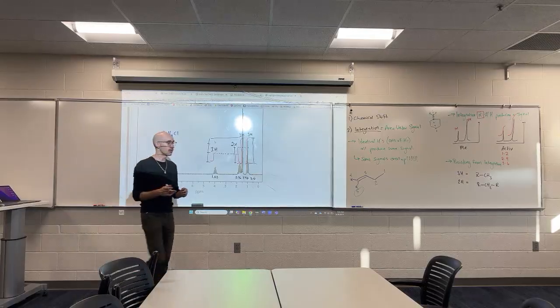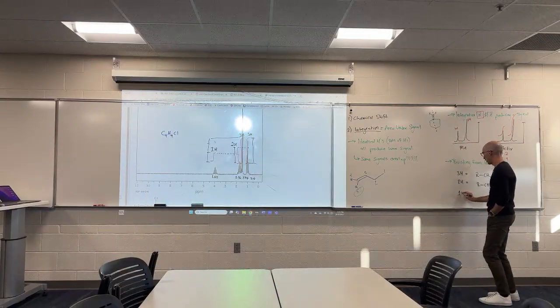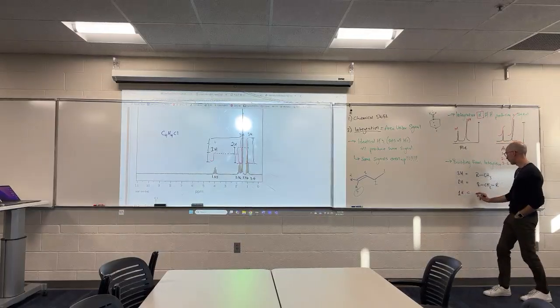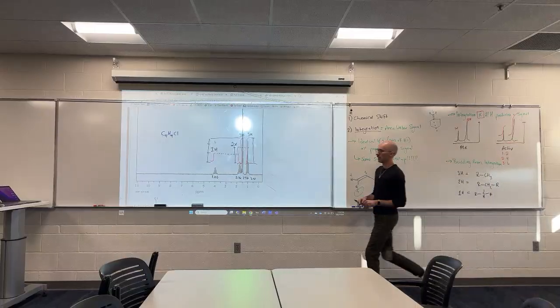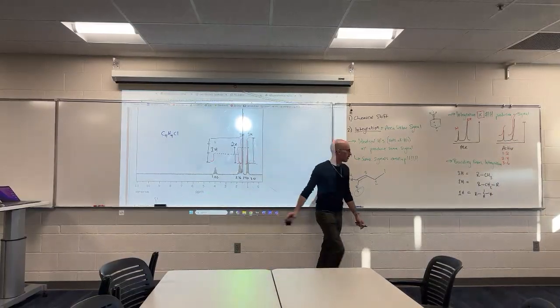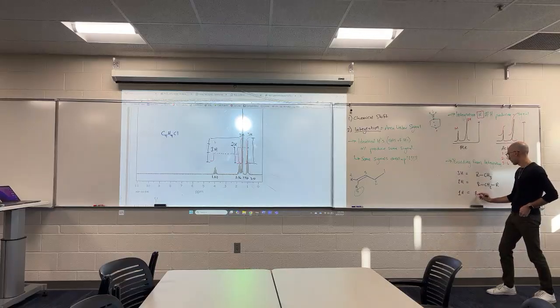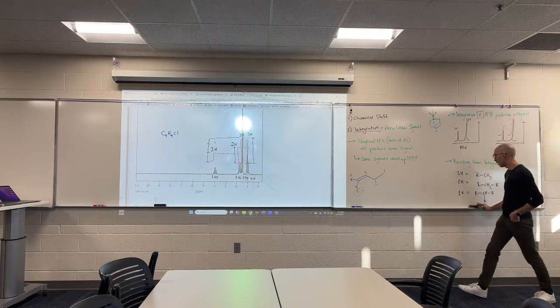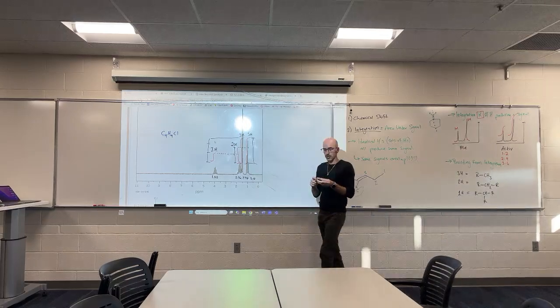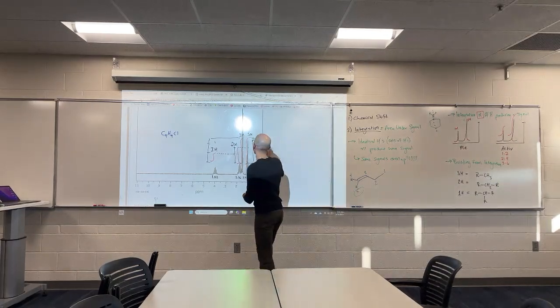The 1H group also simply tells you you've probably just got a CH group bonded to 3 different things in your structure. What those 3 things are, I couldn't tell you, but you've got a lone hydrogen.